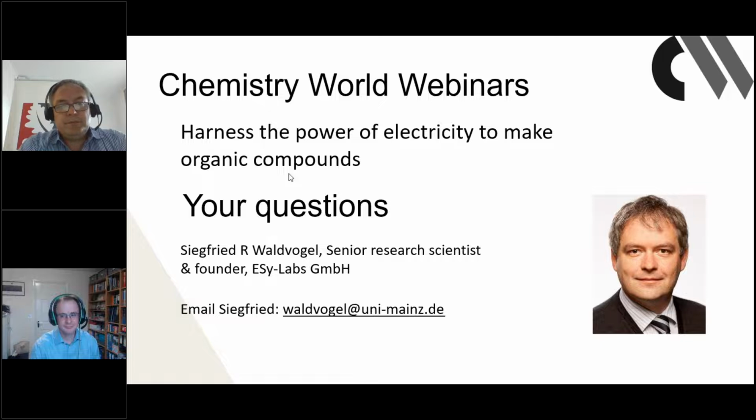Okay, great. So just coming back to something that you mentioned there, you mentioned in your presentation that not all kinds of carbon graphite electrodes are created equal. Can you give us a little bit more information about that, about the kind of differences you see between different types of graphite or carbon?